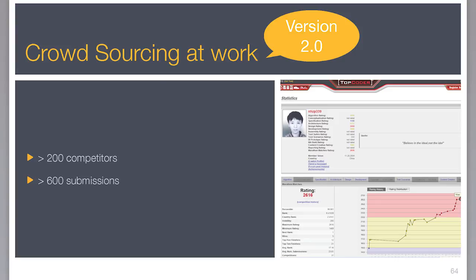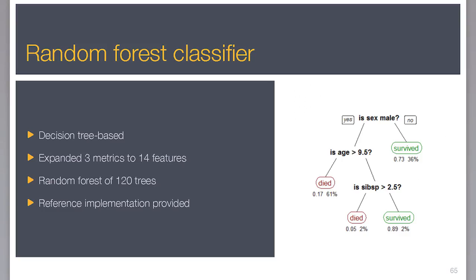So we had to restart the competition, set another $10,000 of prize money, get a better definition out there, and add some noise to our problem. But pretty much all of the winning competitors used some variation of a random forest approach. Again, not surprising simply because of how flexible they are. What did surprise me is we basically supplied them with just 3 metrics, the ones that I mentioned. They combined them into 14 different metrics, by linear or non-linear combination of those metrics, to have a larger parametric space.